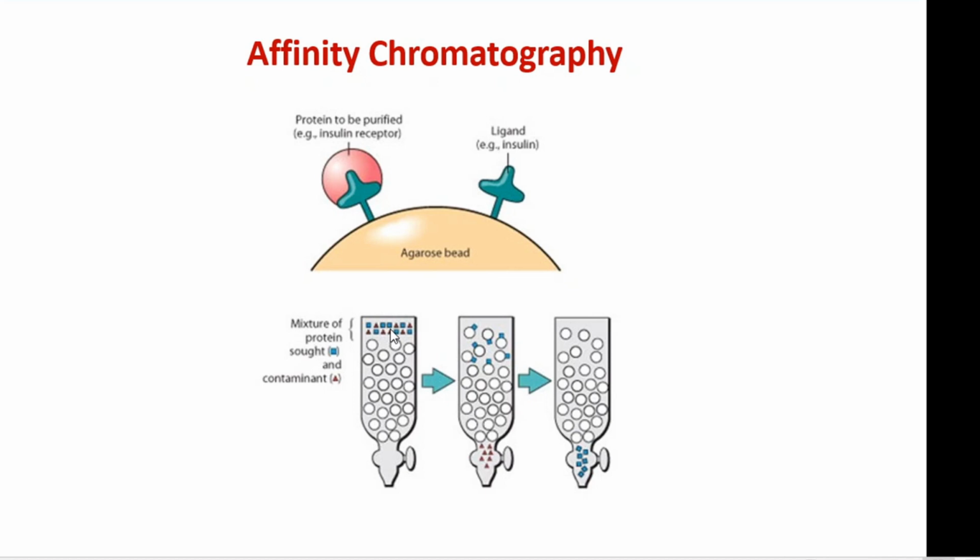So when we place the sample molecules here, you see there is a layer of sample molecules at the top of the packed column, and then when we place the solvent, or what we can call the mobile phase, these molecules will move along with the mobile phase. So they will move along with that. That's why in the second one, you can see the molecules.